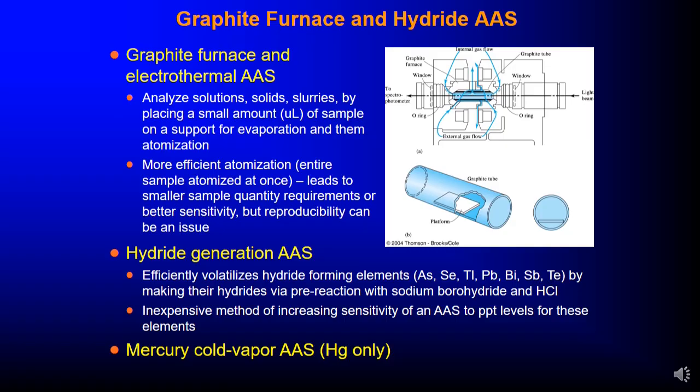We have the hydride generation atomic absorption spectroscopy, and then we also have the mercury cold vapor atomic absorption spectroscopy.